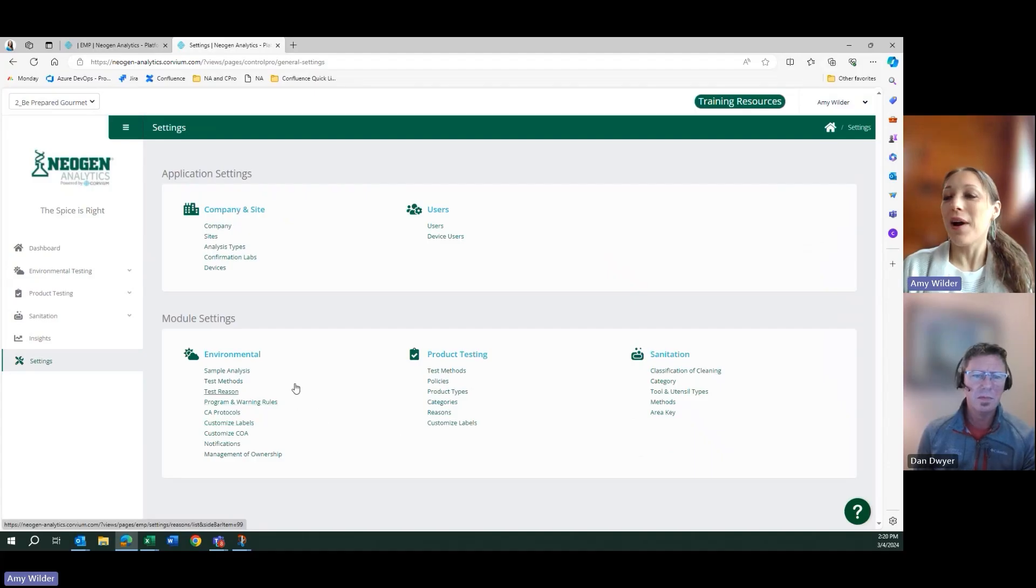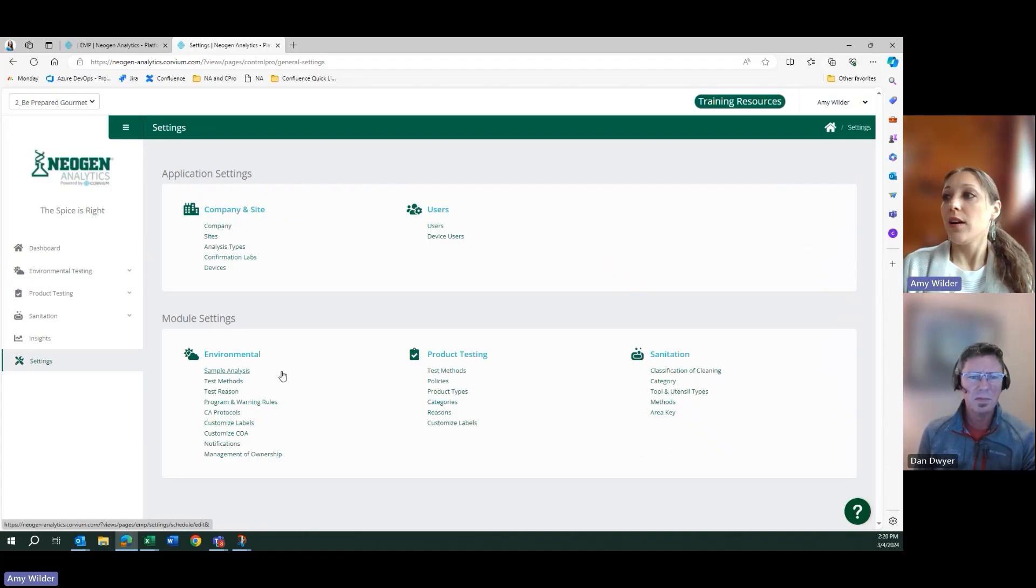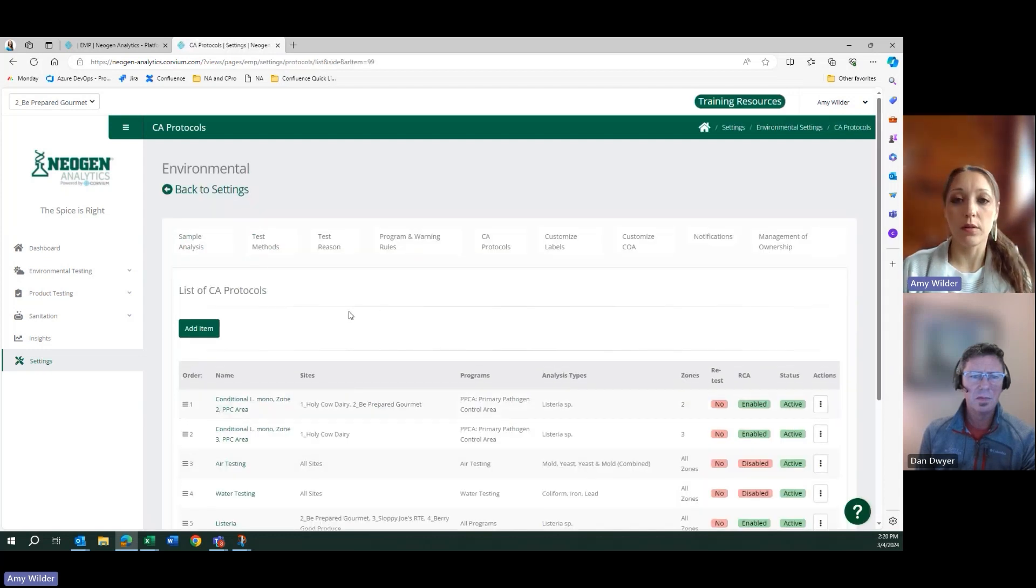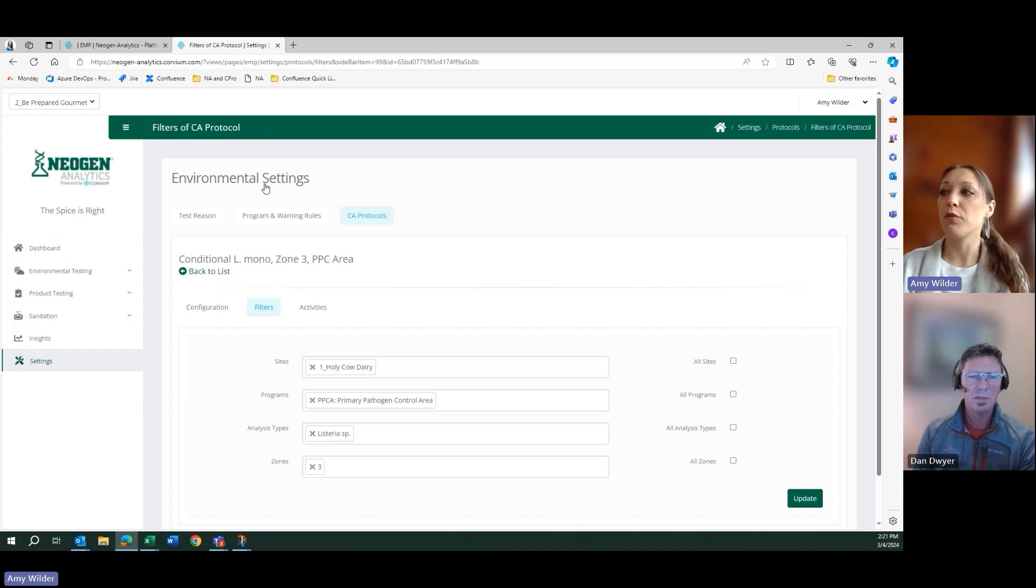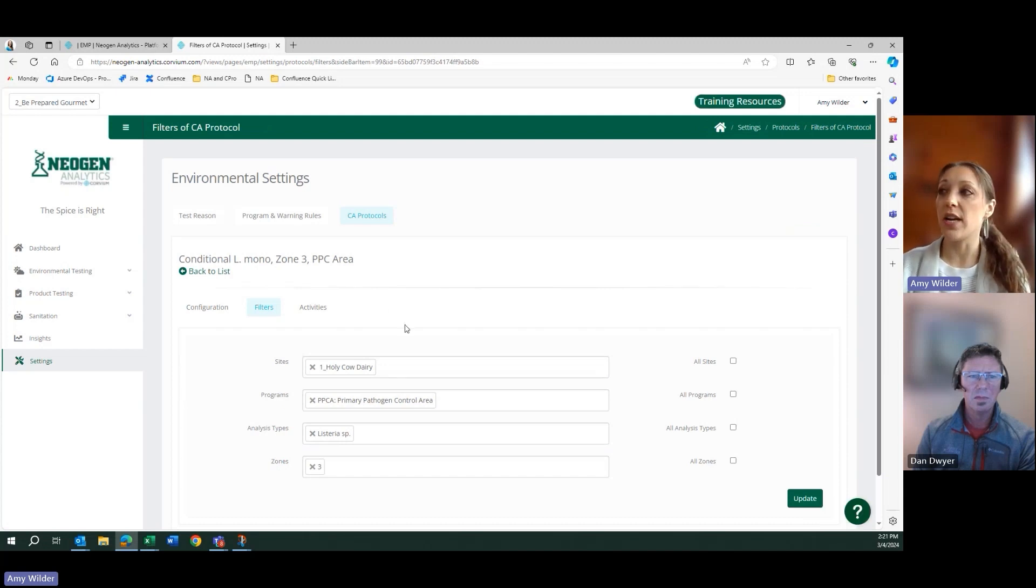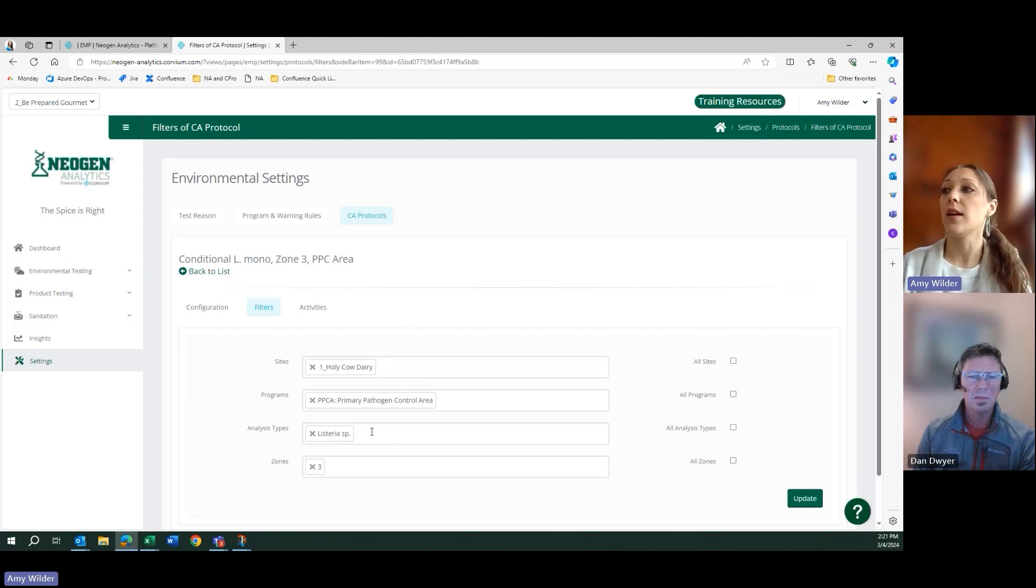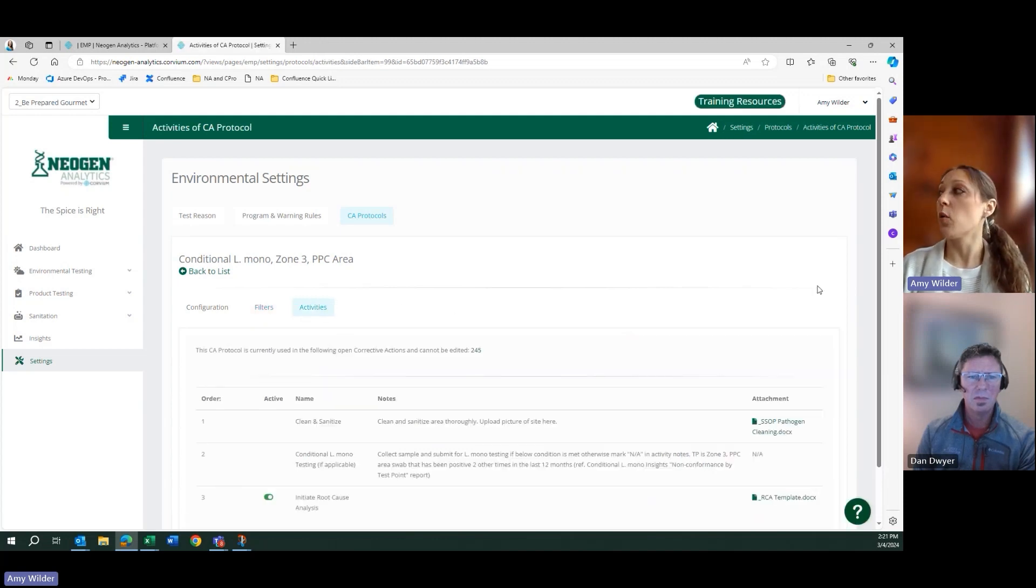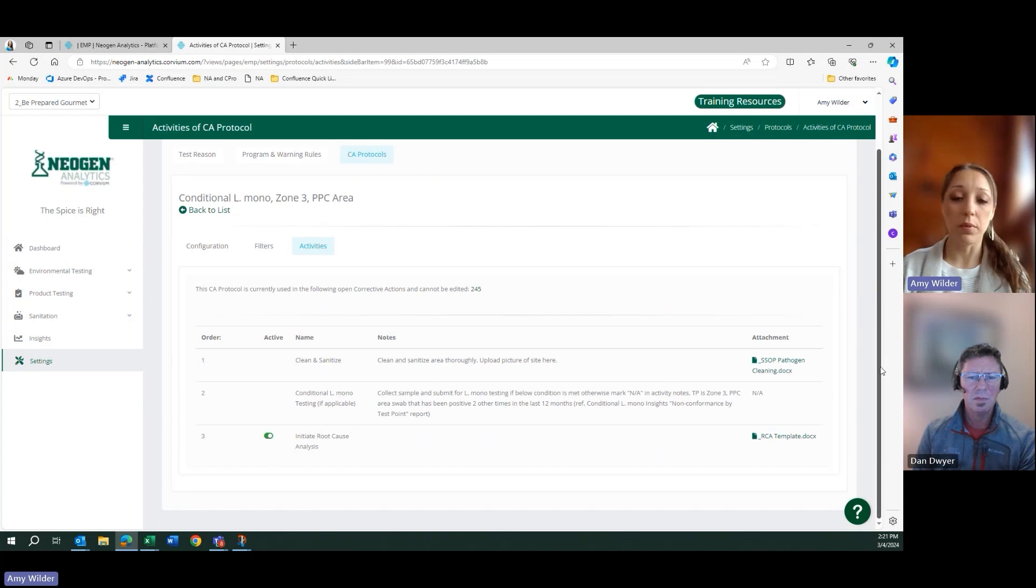Upon onboarding the application, you would have the ability to identify your corrective action protocols. You would then establish through filters when does this corrective action need to be applied? Is it site-specific? Is it analyte-specific? Is it zone-specific? And then you would outline your activities that need to be completed in order to close out your corrective action.